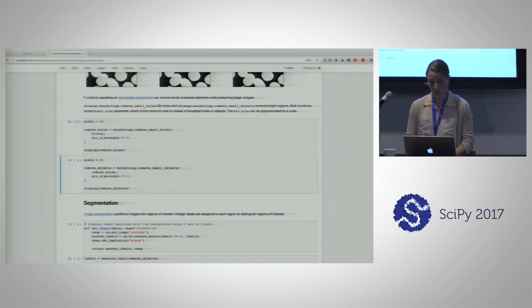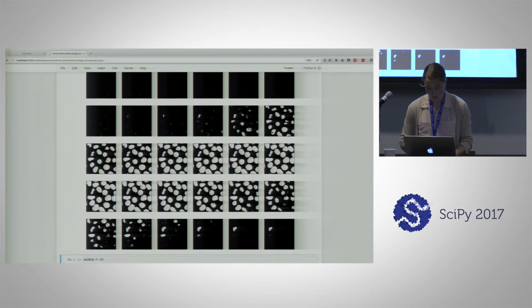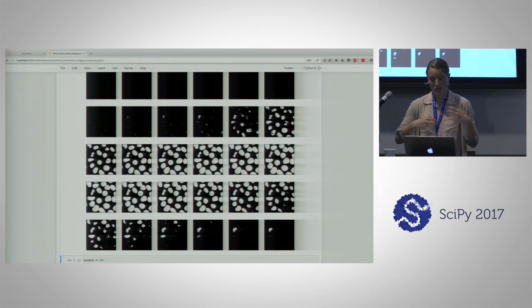So first we'll remove the holes, and we see that each cell now appears to be filled in. There aren't any little gaps. You will see gaps near the top and bottom as they disappear into their murky abyss of whatever they were sitting in. But these aren't exactly holes. They're more craters or cups. The holes were the regions inside the cell that were fully surrounded by pixels.